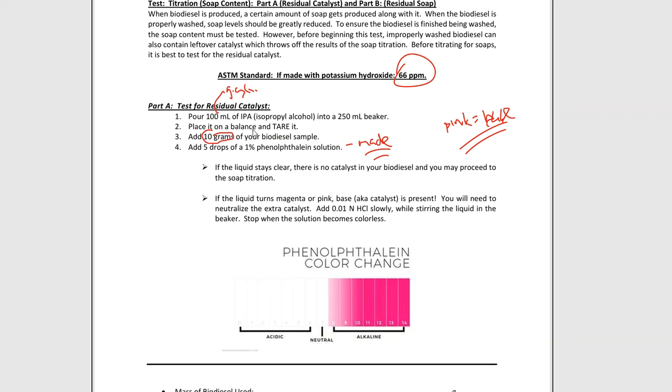So colorless in acidic pH environments. So colorless on pH of 0, 1, 2, 3, 4, 5, 6, and even 7. Then when you get to pH of around 8 to 8.5, that is where you see this color change take place, and we get that nice baby pink color in the beginning, and then we get big fuchsia bright pink colors toward the end of that, and that's of course something that we don't want.